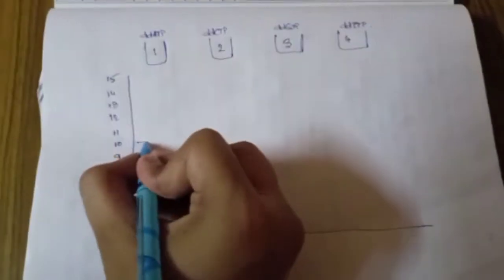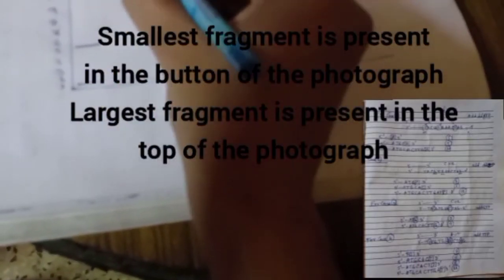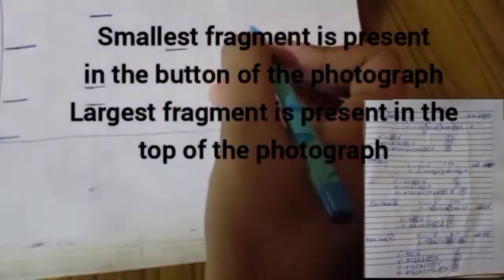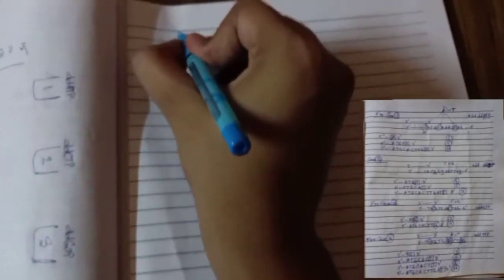In gel electrophoresis, DNA fragments are present in different lengths. The number of nucleotides in the fragments shows its length or size. Please remember the sequence and we will get this type of bands.